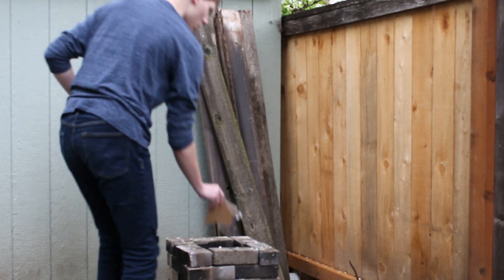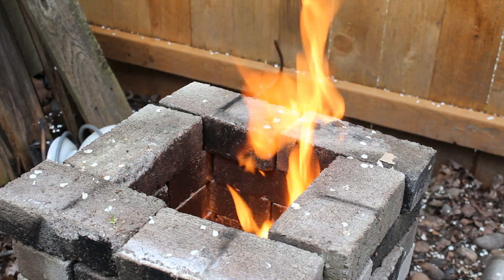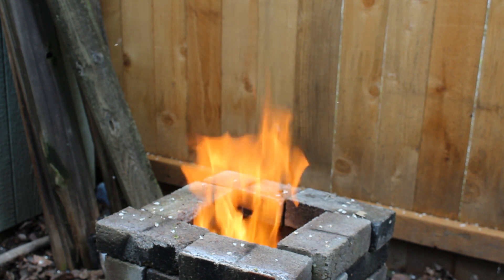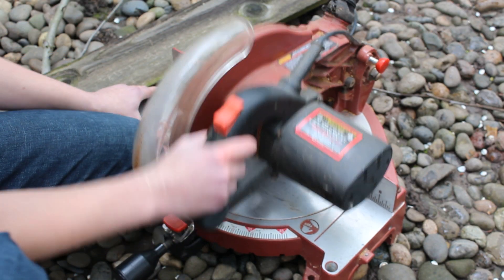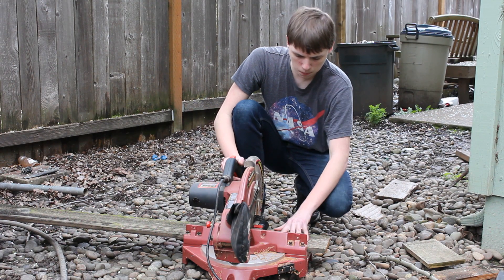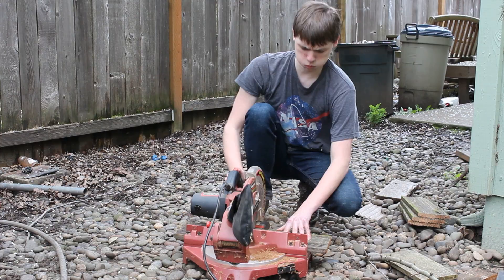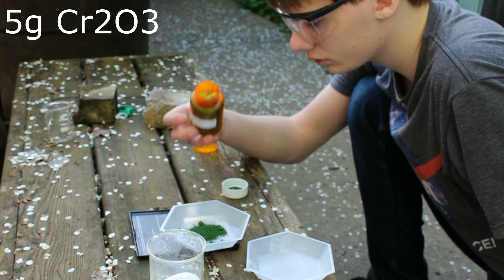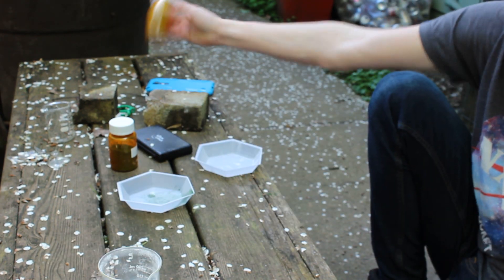I'm using the roasting method, which requires fire, so I'm going to get that started. I weigh out 5 grams of chromium-3 oxide, and then weigh out 10 grams of sodium carbonate. I mix the two ingredients thoroughly, and I put it into a ceramic dish.